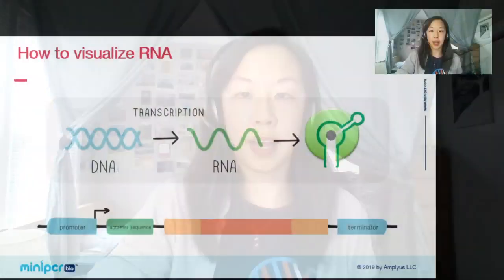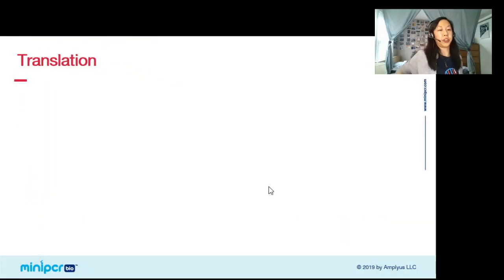And as for the difference between these 3 tubes, we'll learn about that more as we visualize the second process, which is translation. Alright, so I'm going to turn my light back on. Switch back to slides.